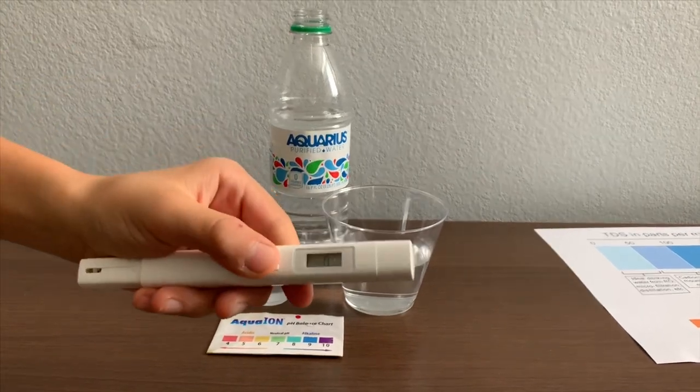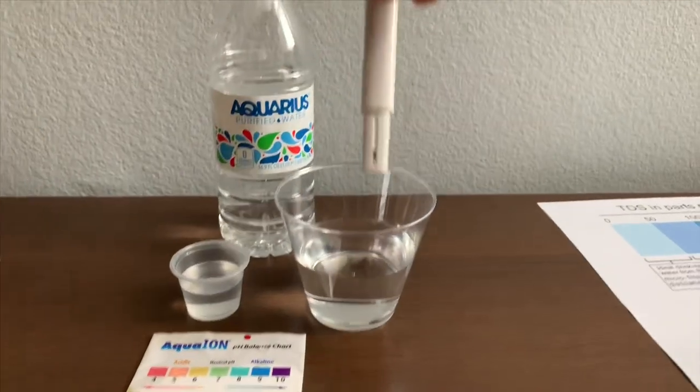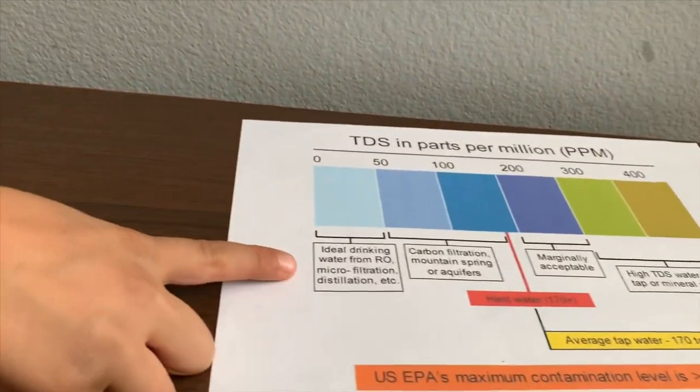Turn on the TDS tester. Make sure it says 0 and put it in. The reading is 3. That is microfiltered distilled water.